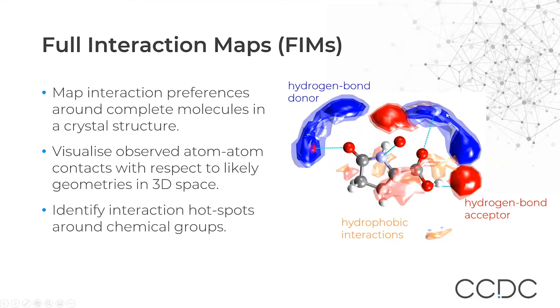We have already turned on the hydrogen bonds, and we observe that these hydrogen bonds are falling exactly where we would expect the interaction to be, thanks to the prediction of the full interaction maps — except for this one here, which is outside the area. So the question would be: what does this mean for the stability of the structure?